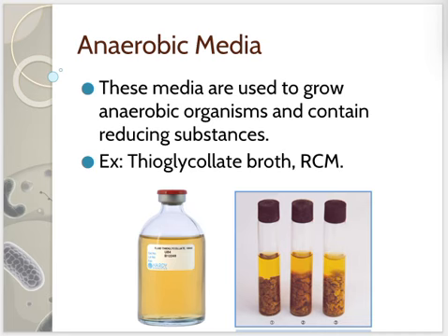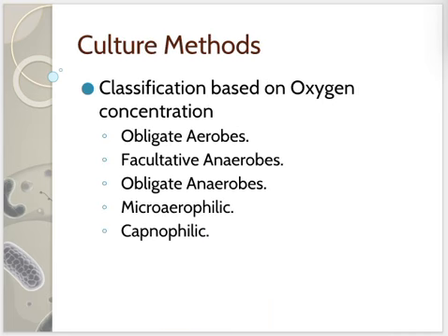Culture methods can also be classified based on oxygen requirements of microorganisms. We have obligate aerobes that need oxygen, facultative anaerobes that can grow with or without oxygen, obligate anaerobes that cannot tolerate oxygen, microaerophilic organisms that require reduced oxygen levels, and capnophilic bacteria that need increased carbon dioxide.